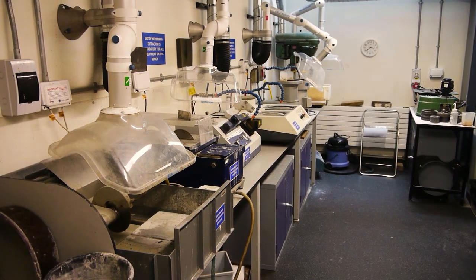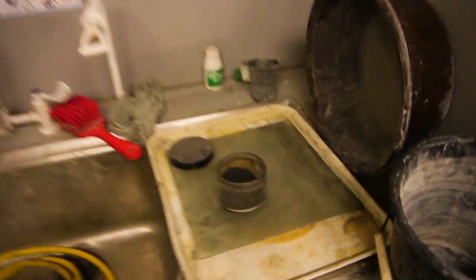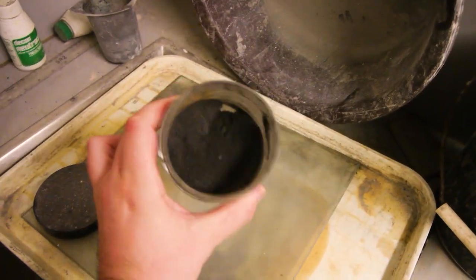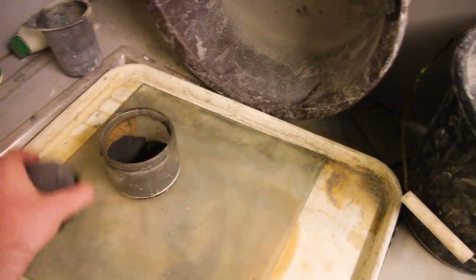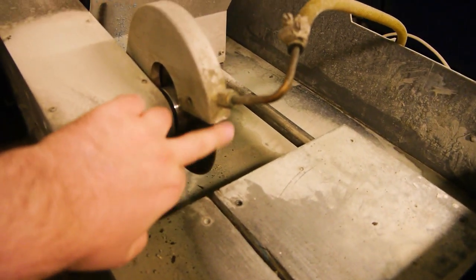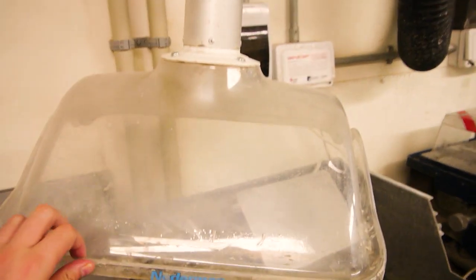This is the rock prep lab where we do all our cutting and preparation of rocks, and I'll give you a quick tour. Over here we've got the polishing area, and this is carborundum powder that we use to polish samples, get them nice and flat and smooth. The saw — a diamond edge saw for trimming the samples off. This is the bloody noisy extractor unit.